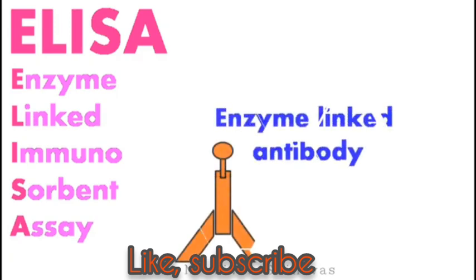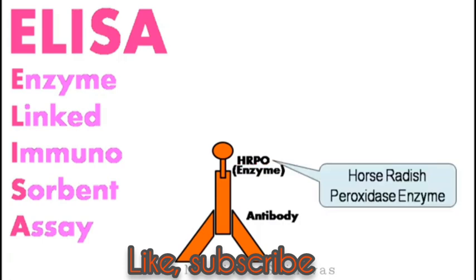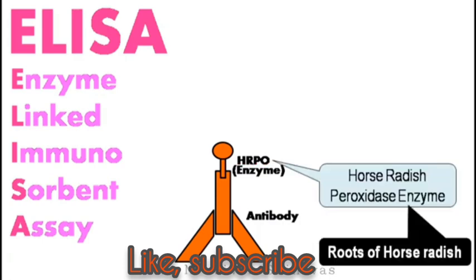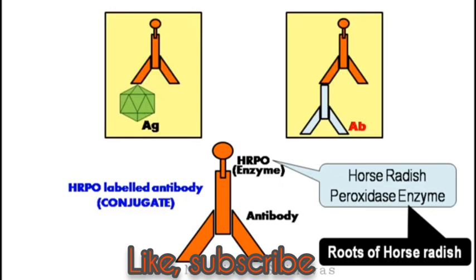In ELISA, the most important component used is the enzyme-labeled, or linked, antibody. They are nothing but an antibody linked to an enzyme, mostly HRPO, that is, horseradish peroxidase enzyme, which is isolated from the roots of horseradish. They are generally termed as conjugate, since they are conjugated to an enzyme. This enzyme-linked antibody attaches to either antigen or antibody.